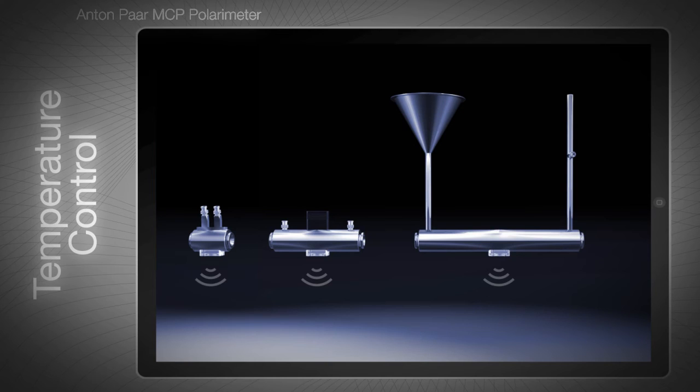Live temperature data is transmitted wirelessly from the cell to the instrument. The wireless temperature measurement is unique to MCP polarimeters. It eliminates connecting cables that could break or need cleaning. Please refer to the video about Toolmaster for more information concerning the wireless Toolmaster technology.